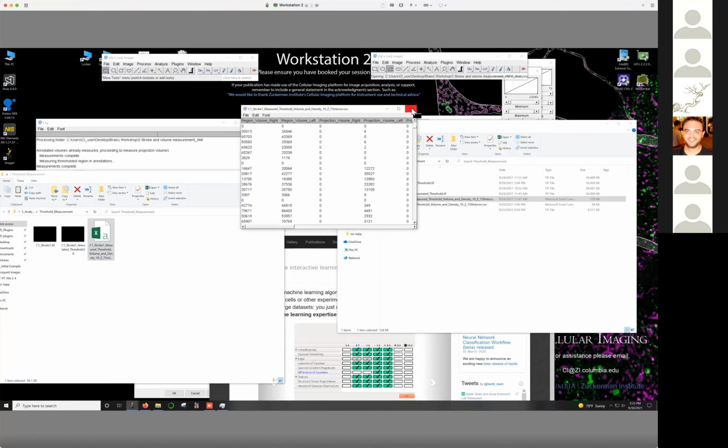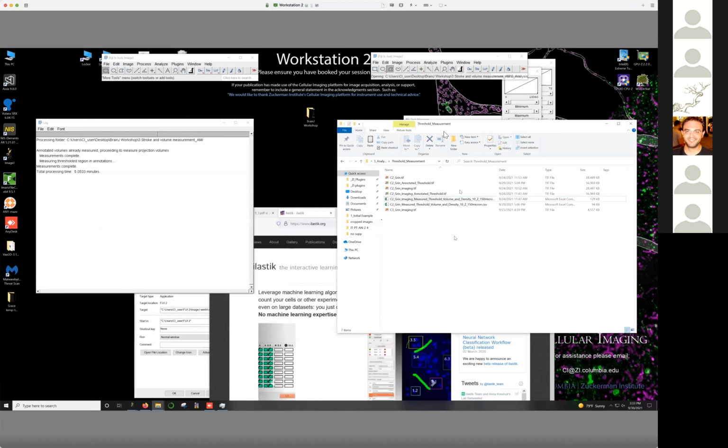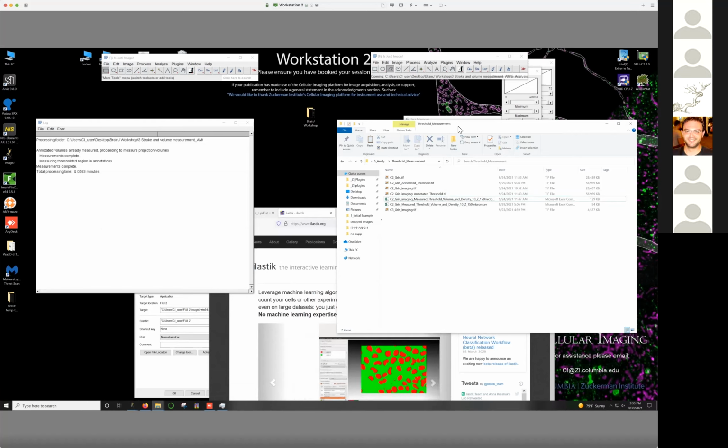Yeah, I think those are the main things I wanted to show you about how to use the pipeline, and hopefully that was also useful in terms of how to use Ilastik as well. If you're interested in learning more about that, then please come to the Ilastik workshop. We'll go into that in more detail, and just how to build that into a pipeline in ImageJ if you want to do a different project that takes advantage of that and automates it.